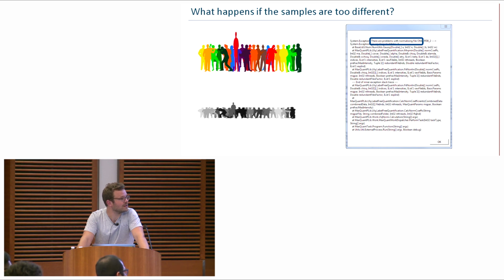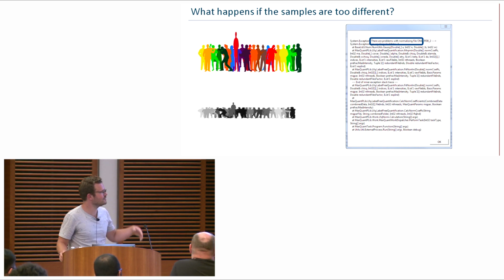Yes? A very quick question. How is the normalization at peptide level impacted by the missing data? By the missing data? Right. I mean, only the peptide intensities are taken into account, so when you're missing data, it's not existing at the peptide level, right?